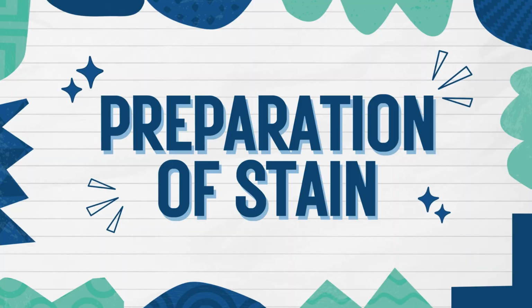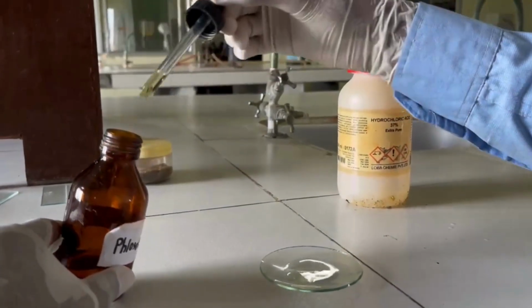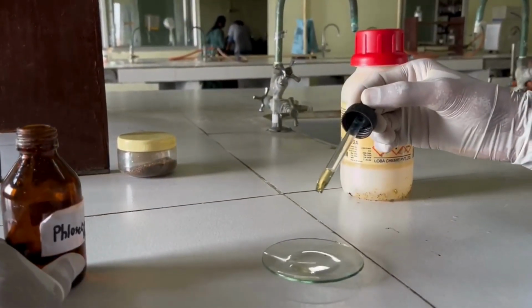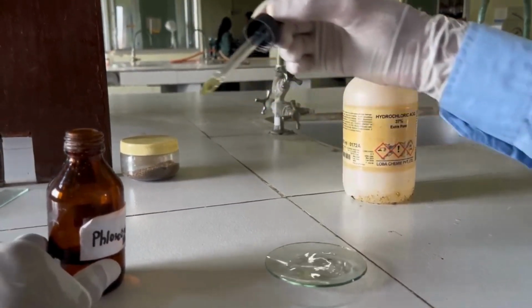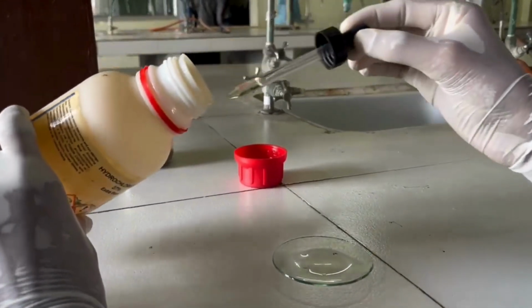Staining process. Stain is used to make cells and other components more visible and to highlight specific features. It is prepared by mixing phloroglucinol and HCl in the ratio of 4:1 on a watch glass.